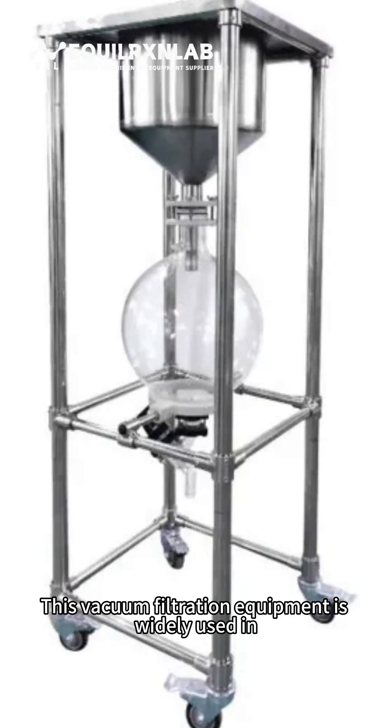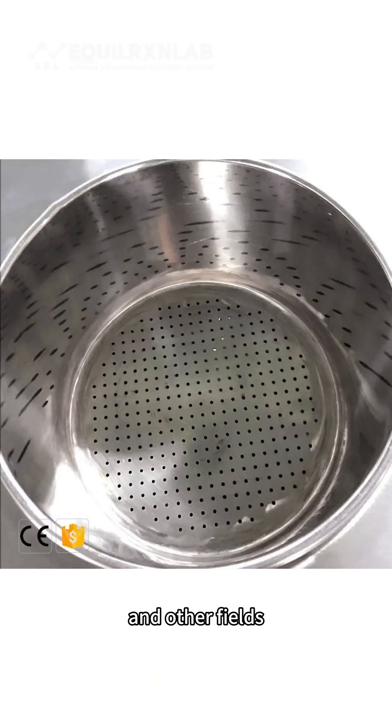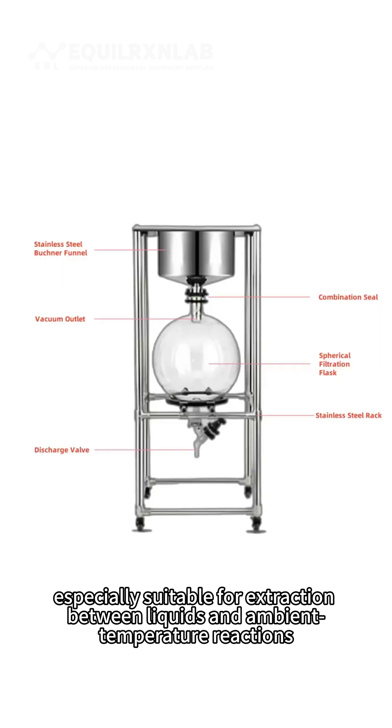This vacuum filtration equipment is widely used in scientific research, health inspection, machinery, and other fields, and is especially suitable for extraction between liquids and ambient temperature reactions.